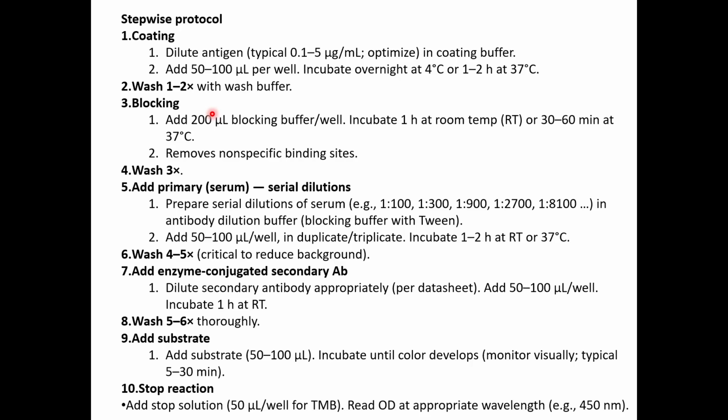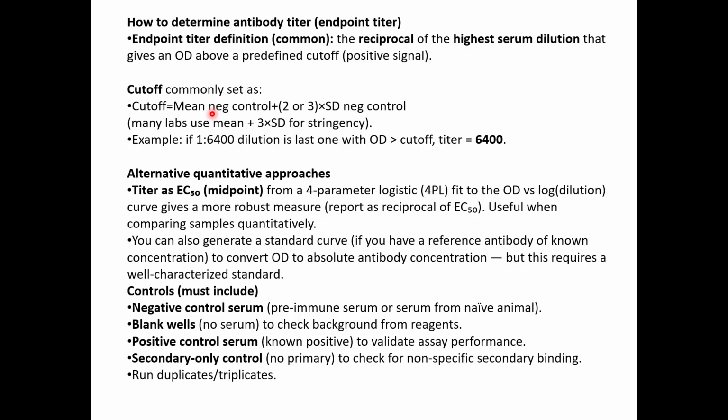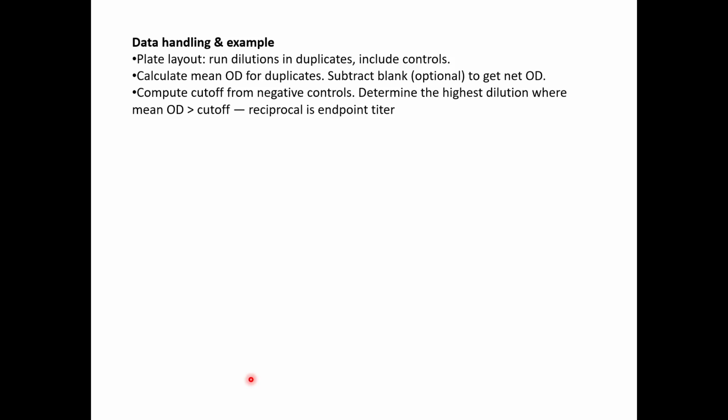Just like in the case of Western blot or immunofluorescence, where you block the regions where there might be non-specific binding of your secondary, similarly here also you have blocking. This is also another control which you can use. And of course, whenever you do ELISAs or these kinds of quantitative tests, you always do it in duplicates or triplicates so that any sort of handling or measuring errors are eliminated.